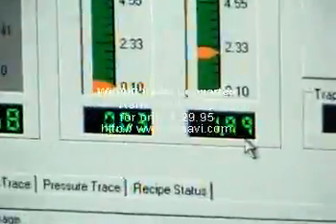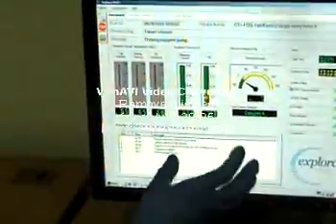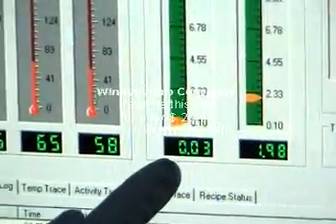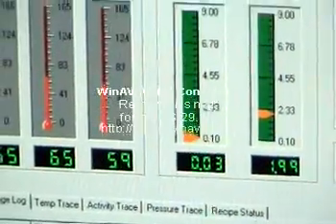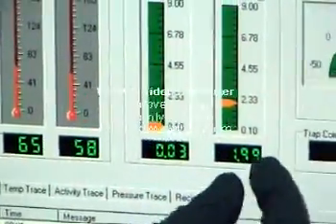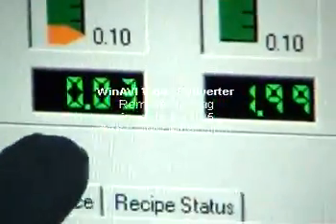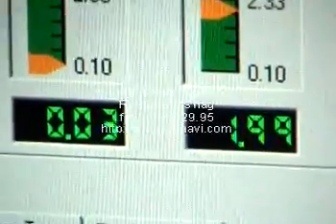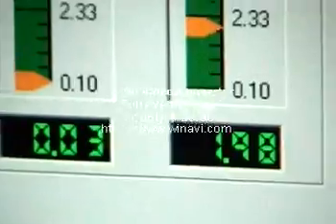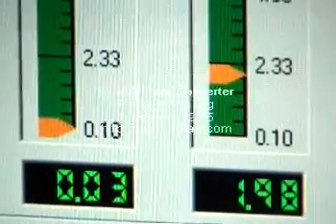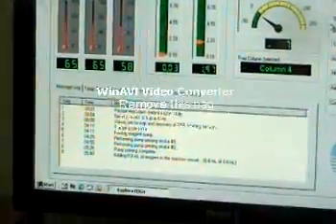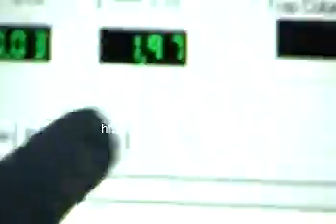Once the F-18 is trapped completely in the QMA, just click on this. Now the F-18 trapped in the QMA will be delivered to the reaction vessel by the addition of cryptofix solution. You can see how the activity leaves the QMA and enters the reaction vessel. The activity coming into the reaction vessel is displayed here. You can see the QMA reading now showing 1.96 curies — now it will start transferring.